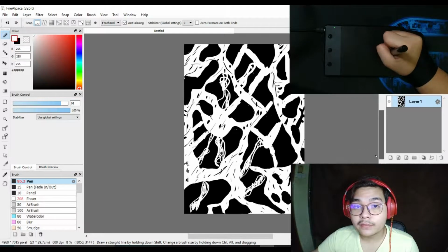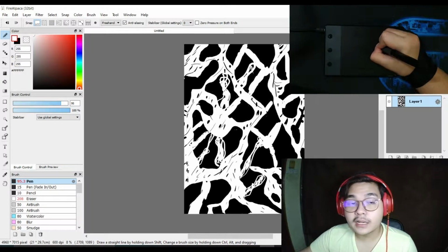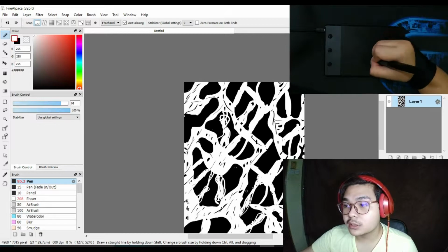The second result we have is white cast iron. The dark spot is pearlite, while the light region is cementite.